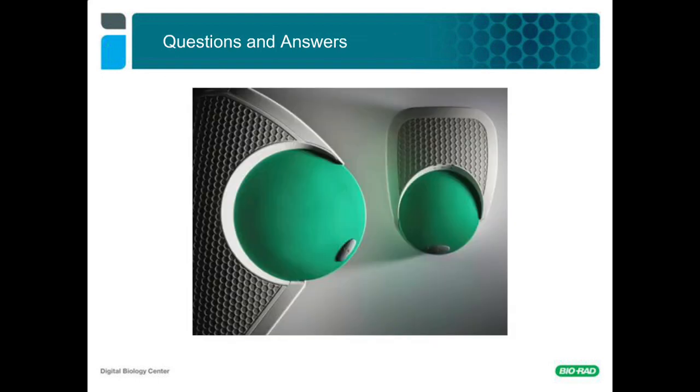So our next question is from a user who's been running SNP detection assays, and they have noticed the negative droplet intensity increase down the columns of their 96-well plate. Do you have any suggestions as why this occurs and how that can be minimized?